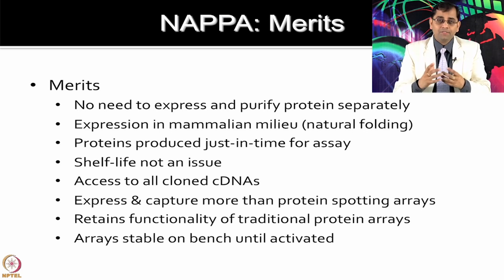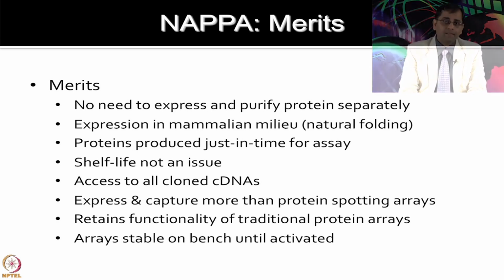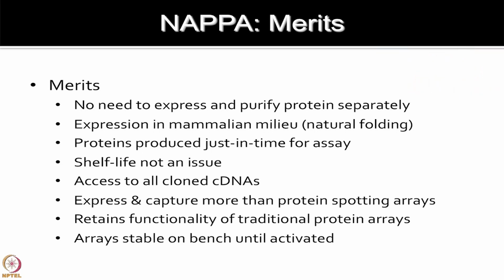Hopefully, the proteins which are expressed are also retaining their functionality, and it has been shown from other experiments that these proteins do maintain their functionality and they are very stable on the bench until you activate them with the IVT mix and incubate at the right temperature.